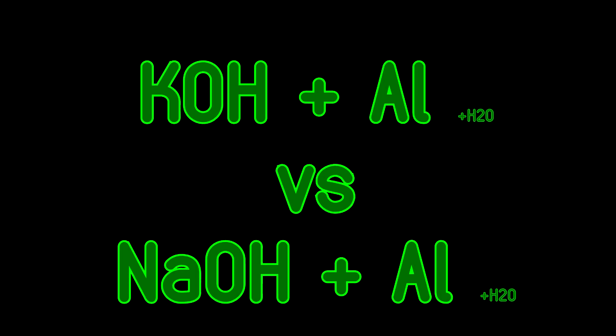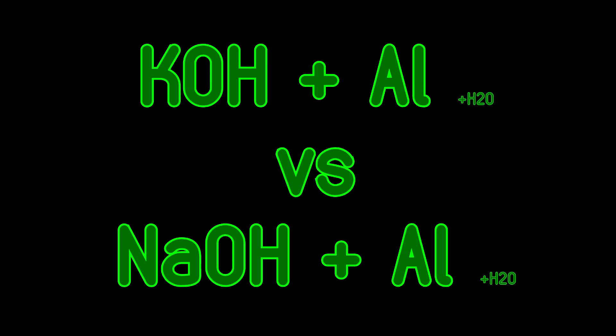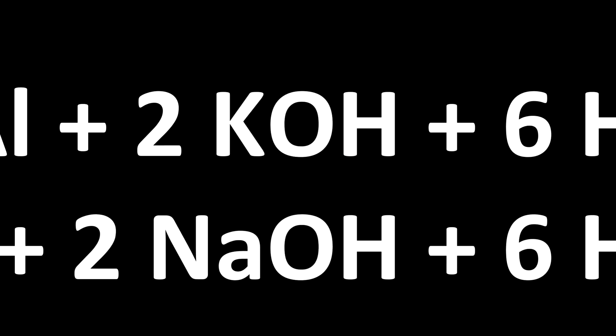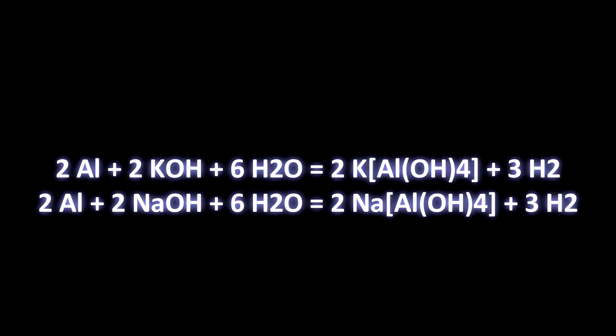Hello there. In this video I will experiment with the reactivity of aluminum with sodium and potassium hydroxides. I should say that this might be dangerous — these two hydroxides are corrosive, they will burn your skin and eyes. Be safe. I wanted to see how they both react with aluminum and maybe see if any of them reacts faster or better in any way.